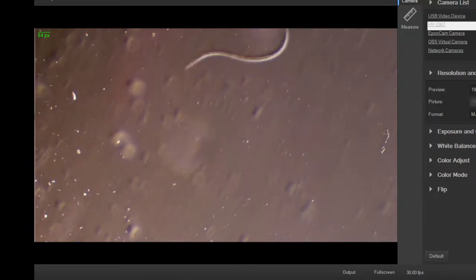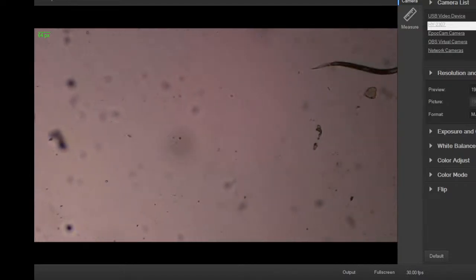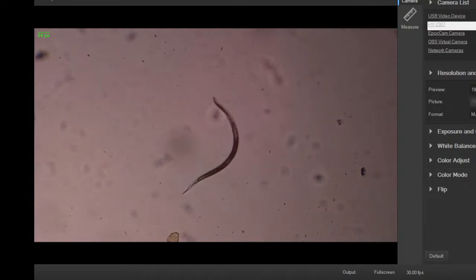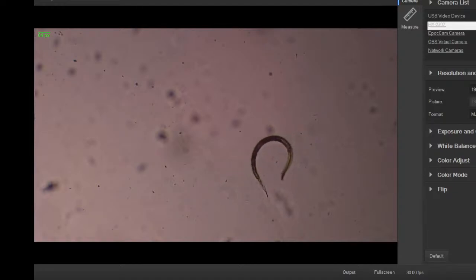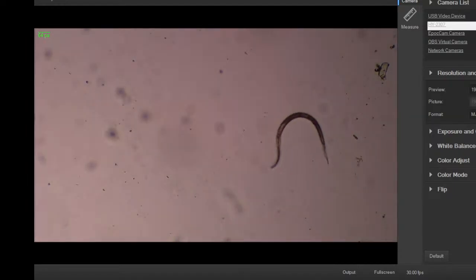Typical lighting here. It's your standard microscope lighting without any special tweaks. Still nice. This is how 99% of the world looks at stuff in a microscope. Need a little more light, transparency. But yeah, that's the typical view there. A sinusoidal pattern.